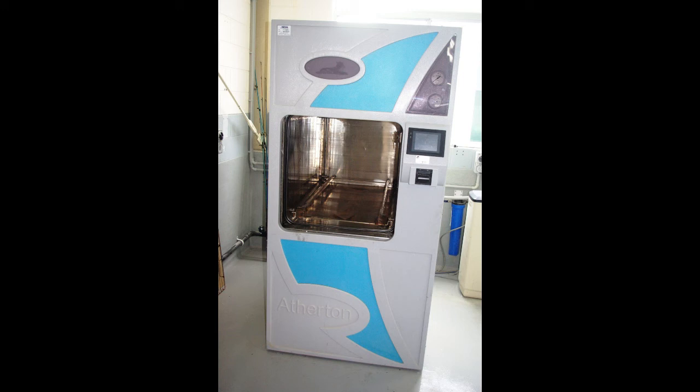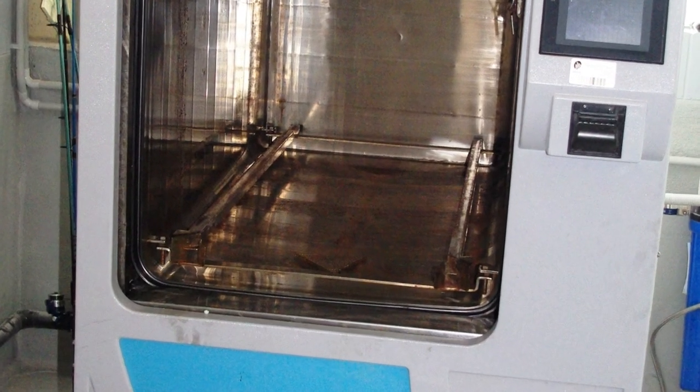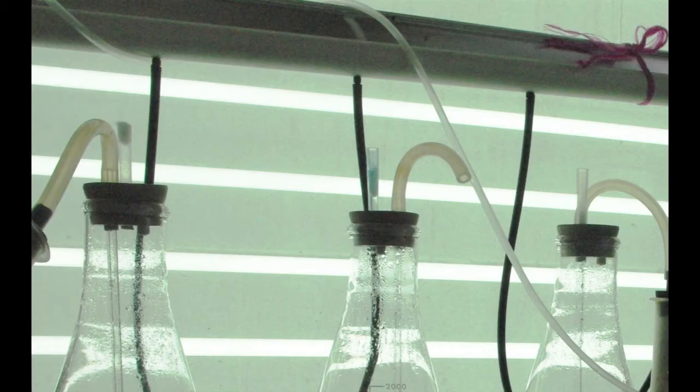Flasks and carboys with F-media nutrient solution already added should be sterilized in an autoclave. Prior to autoclaving, vessels should be capped with rubber bungs fitted with one open port for steam to escape. Airline fittings should be sealed to prevent overflow.